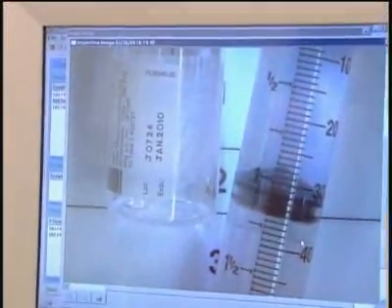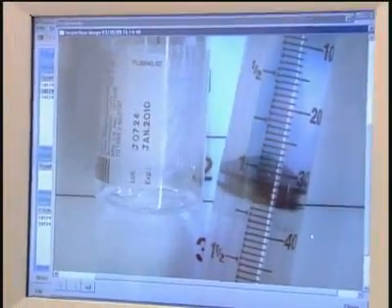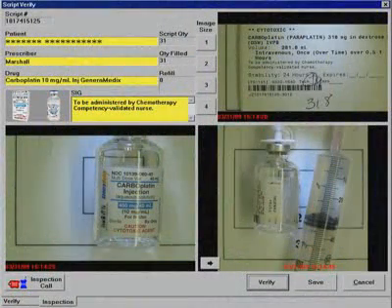So do you feel this brings a lot of safety into the process? I like this when I'm dispensing an intrathecal medication, because sometimes the nurse practitioner would like to see the product that was actually put in there. So I can provide them with an image of the exact drug that was used to prepare the product.